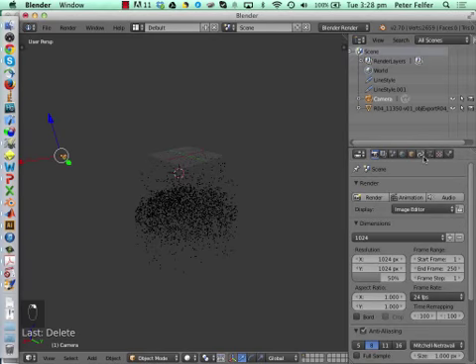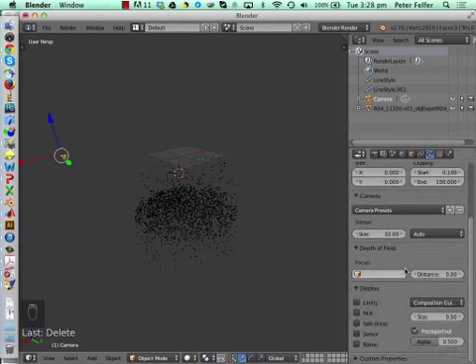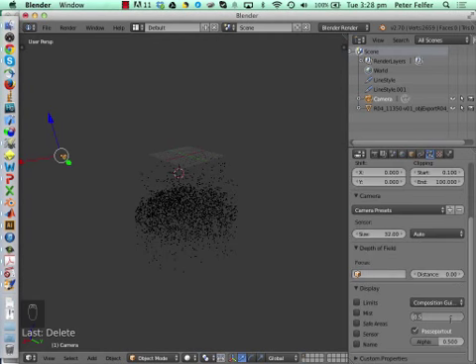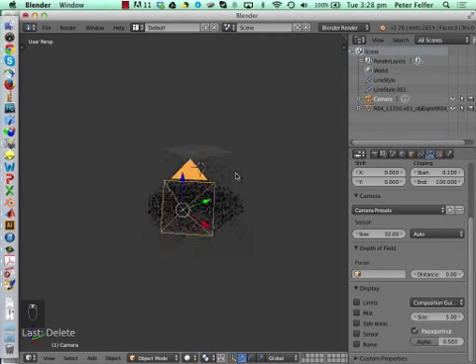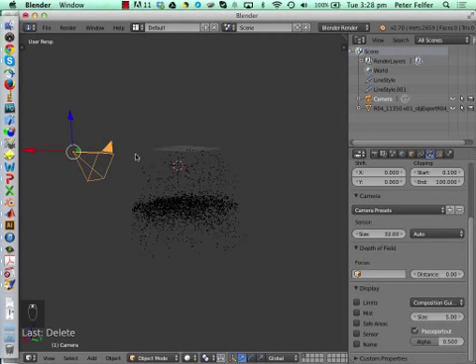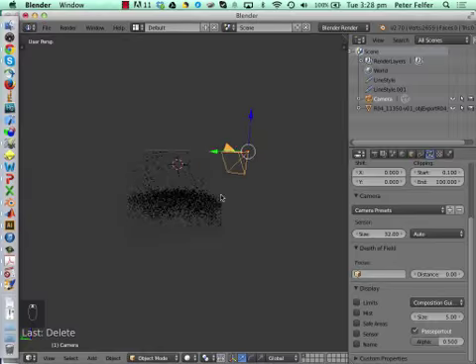Alright, I'll just go and make the camera a little bigger, because the Blender unit is supposed to be meters. So right now our data set is something like 80 meters, which is an unusually large object. But if we want to keep our camera in size proportion, we'll just make it 5 Blender units, so we can always see. It's got a decent relation in terms of size.